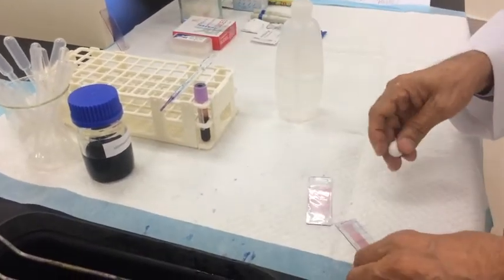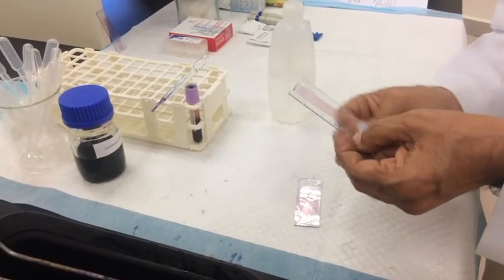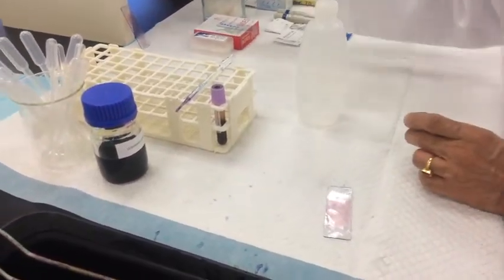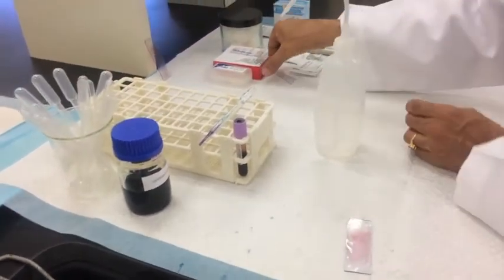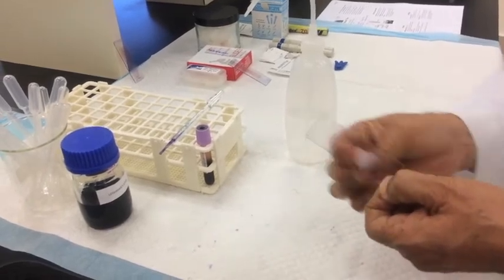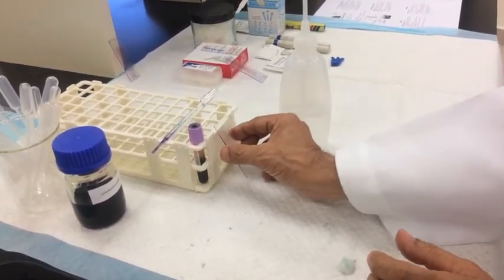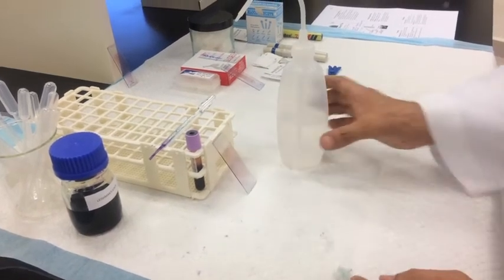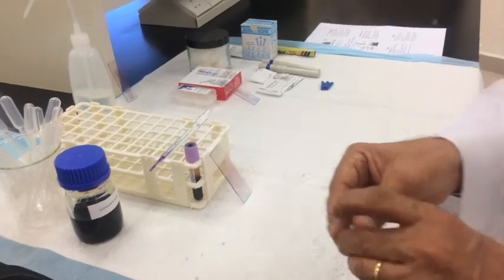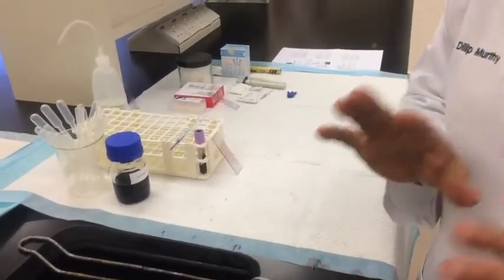Allow the slides to dry by keeping them at a slanting angle so they dry by themselves. Once dry, the slides are ready for viewing under the microscope.